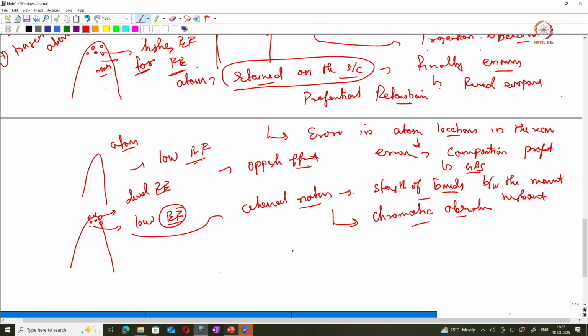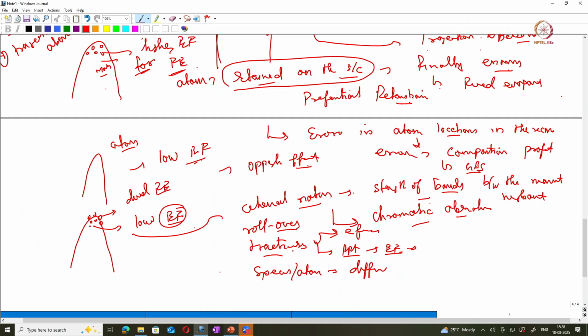Okay, so we discussed mainly three types of aberrations, which are rollover or roll up, trajectory aberrations, which can be due to the specimen itself, the type of specimen and the electric field distribution, and the other is if there is a precipitate which has different evaporation field values than the matrix, and another is species or atoms which have different evaporation field values than the matrix.